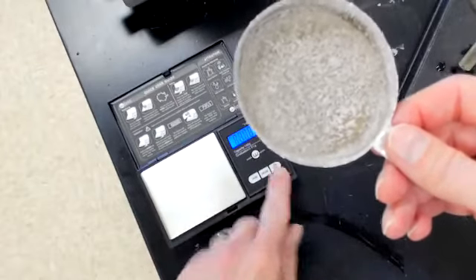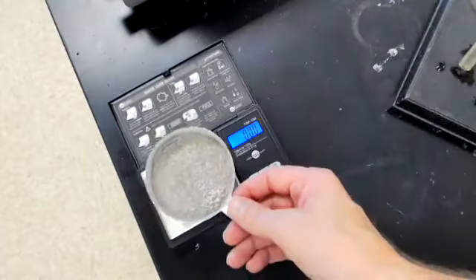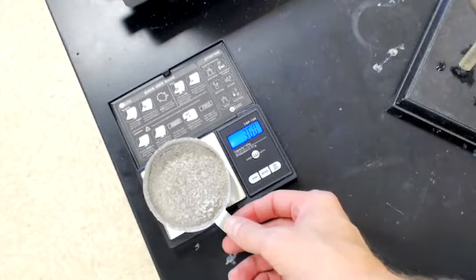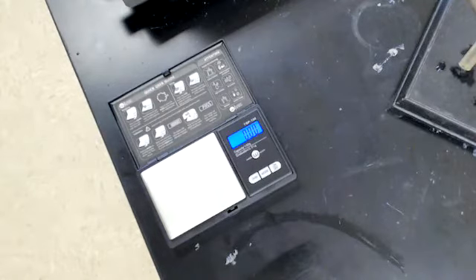I'm going to put it on the electronic balance here. And I see, so this is number 18. So number 18 is 3.59. And now I would think I'm done, except I realize I forgot to tell you the mass of the original. So I'm going to go wash this out real fast and dry it out real fast. And then I'm going to bring it back and we're going to be able to get the mass of the original.